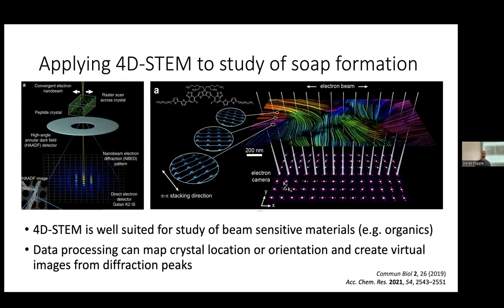And so just as a brief background to some of these electron microscopy techniques, I'm sure many people that are involved in research of different artifacts for archaeological applications are well-versed with scanning electron microscopy. In that technique, you have a focused electron beam that rasters across the surface of your sample, and then you're collecting the backscattered electrons in order to create an image. And by doing that, you can get below the diffraction limit and actually see things that couldn't be resolved with optical light.